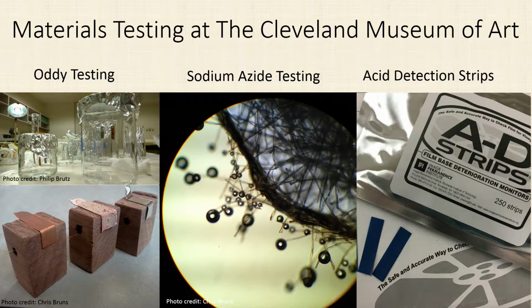My work is meant to determine whether or not these materials are safe to use with artwork, because over time, some materials that you might not suspect to be harmful can degrade the materials an institution is working to preserve. For an obvious example, a showcase constructed of wood, let's say oak, will off-gas acetic acid. The acid, now airborne and trapped and concentrated in the microenvironment of the showcase, will have deleterious effects on art objects, degrading organic materials and causing metals to corrode. But other less obvious materials can also contain harmful pollutants.